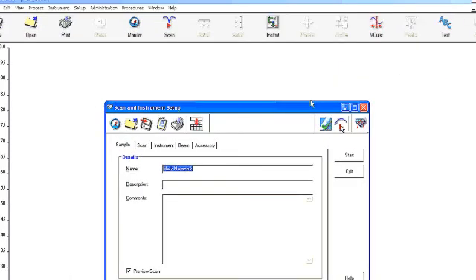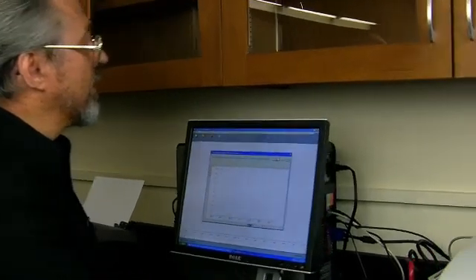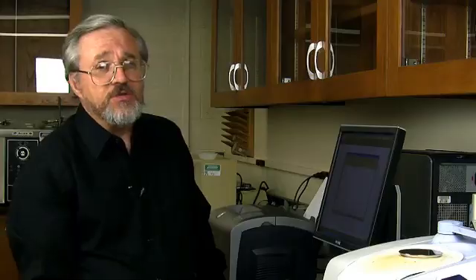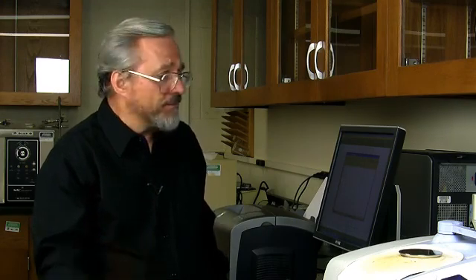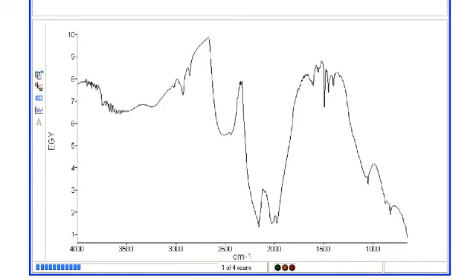So you click on that, and then you click on the button marked Scan, and you wait. It's going to take four pulses of IR radiation to give us the proper background scan. And you can see already that we are getting our background.